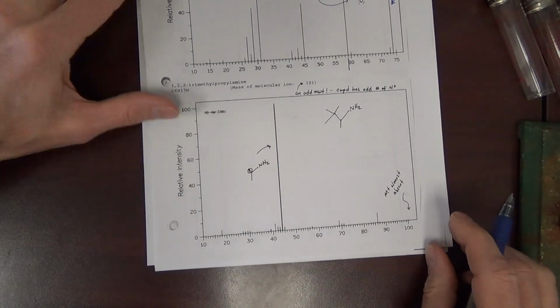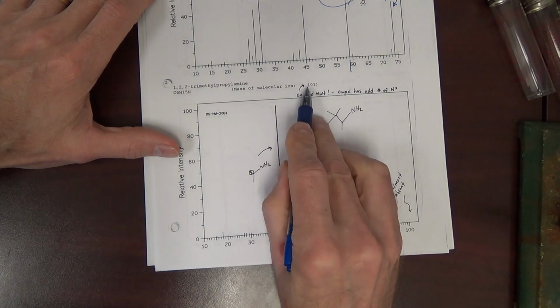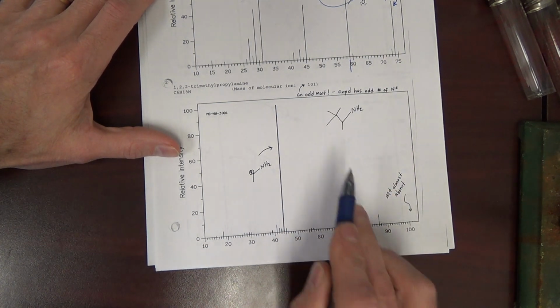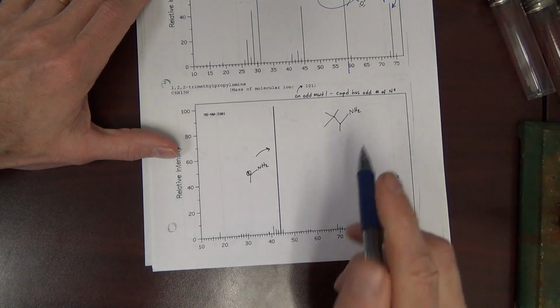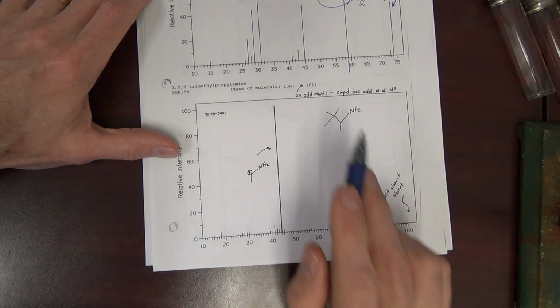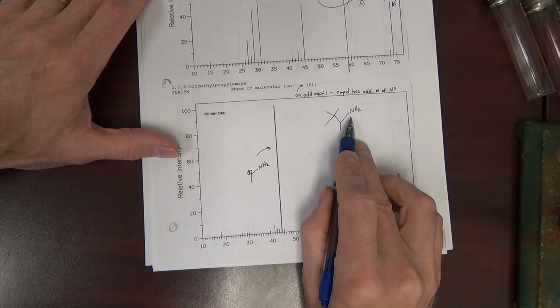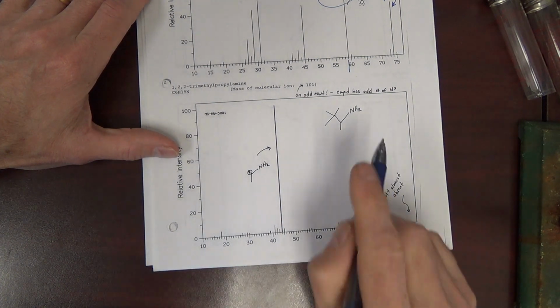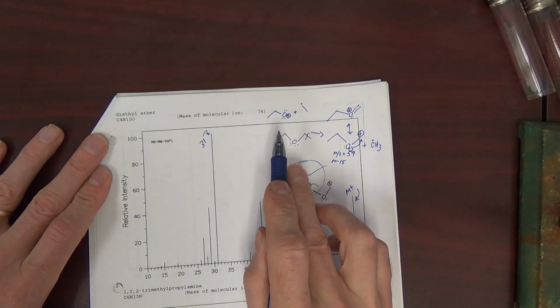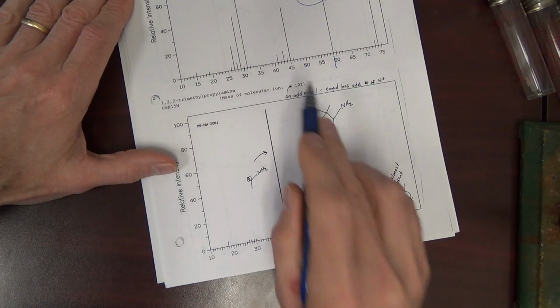Compound below. First off, this is the first molecular weight that we've seen that's odd. But that's to be expected because of the so-called nitrogen rule. If a compound has an odd number of nitrogens, the molecular weight will be odd. If the compound has an even number of nitrogens, or zero being an even number in this case, the molecular weight will be even. For example, up here, no nitrogens. We consider that an even number. Thus, it's an even molecular weight. One nitrogen, odd molecular weight.